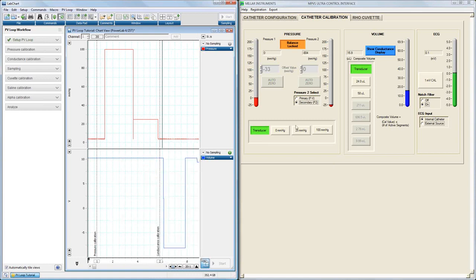Do you have to use these pressure outputs? Do you want to trust them? Do you want to actually have a solid gauge reading, just so that you know everything's going to be correct? You can also verify. You don't necessarily have to use the calibration outputs.